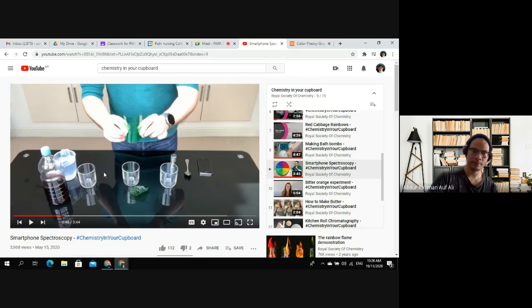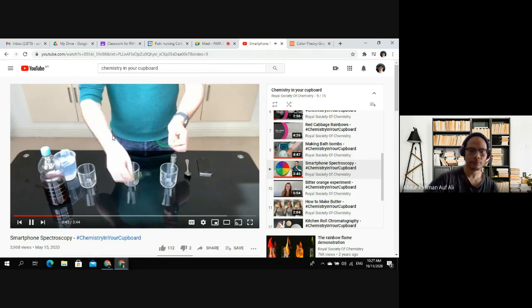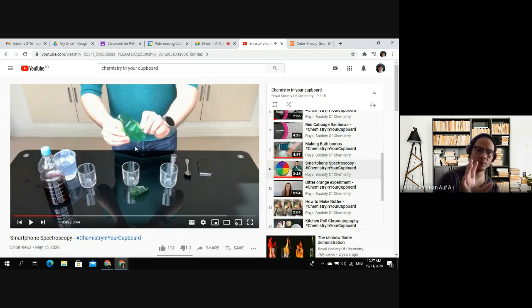Saya rewind. Biasa dia suruh guna warna hijau dekat sini, paper warna hijau as a filter. Okay, bila kita pancarkan lampu suluh, letak plastik ni dekat depan lampu suluh. Gunakan dia sebagai filter because kita nak pancarkan warna hijau sahaja. Because inside a spectrophotometer, saya cakap tadi, ada sumber lampu, there's a light source, and after the light source ada satu filter nama dia.